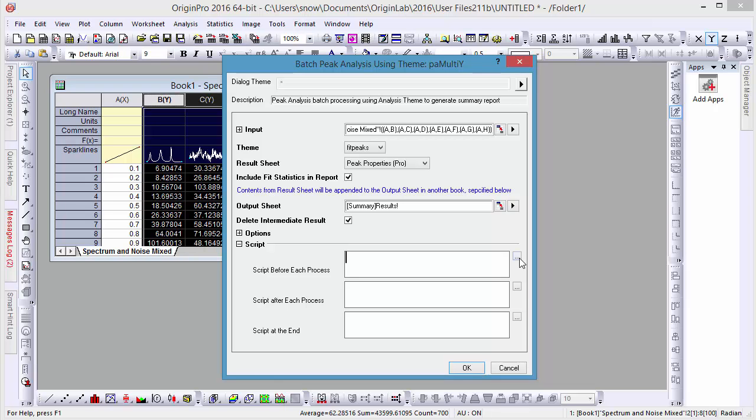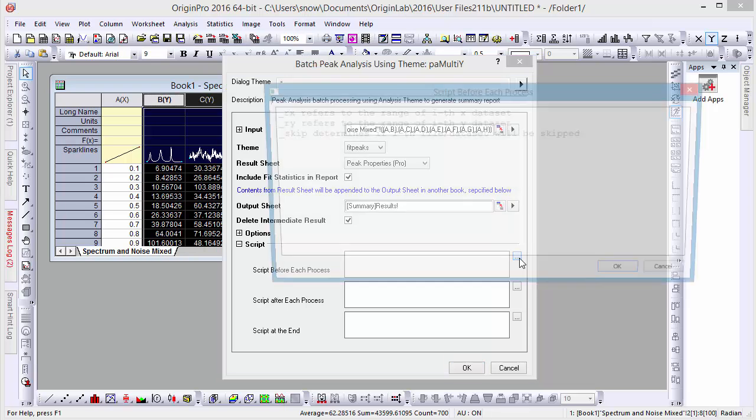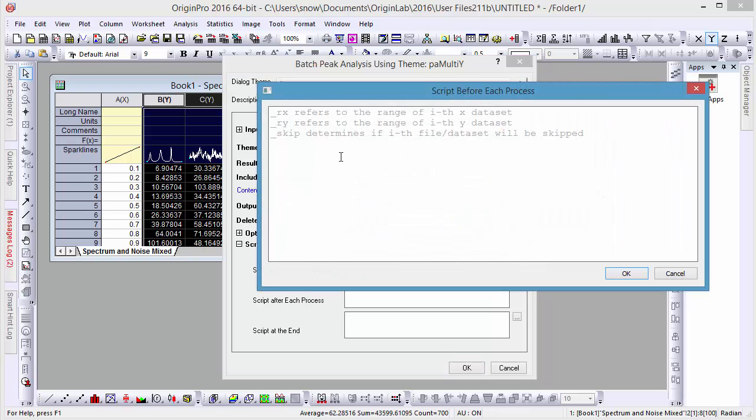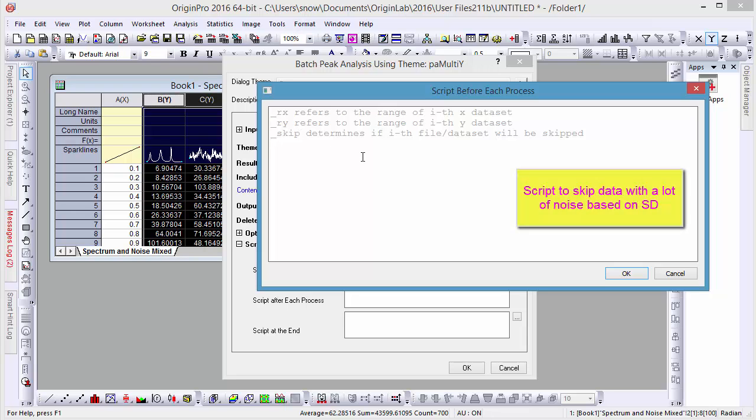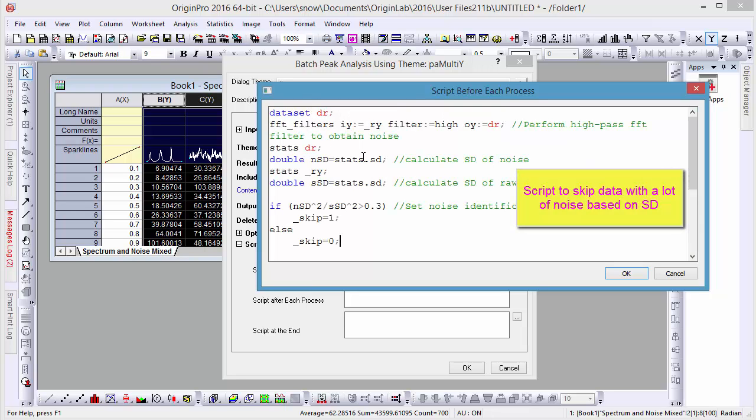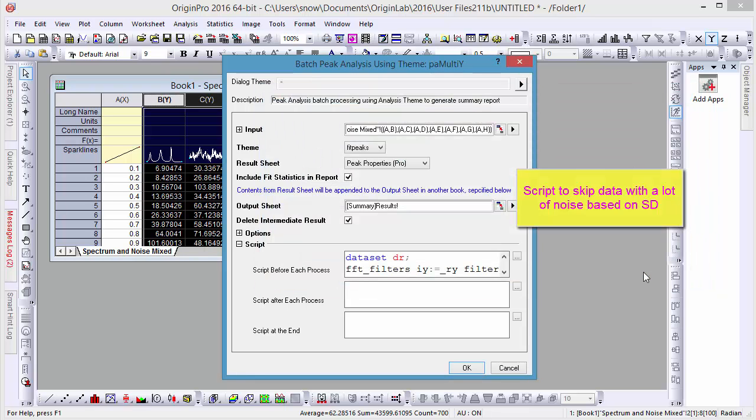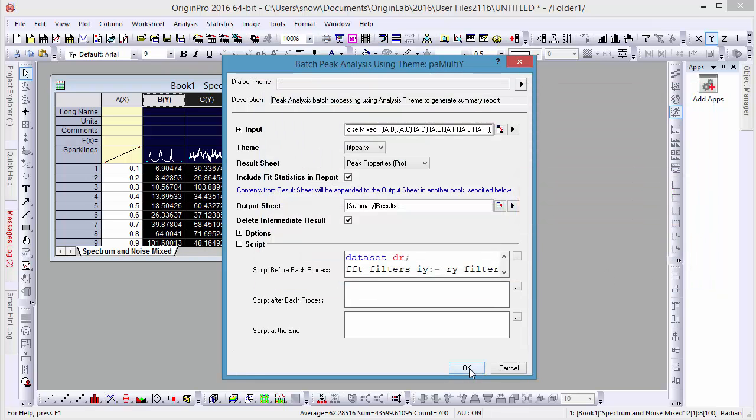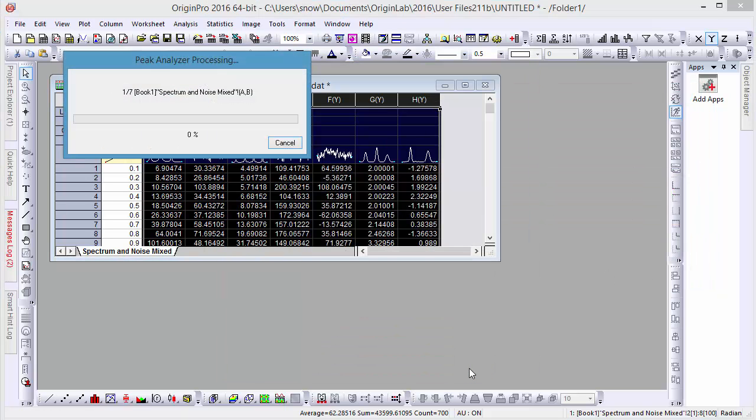To add our script, let's go to the Script Before Each Process box, and click on the Ellipses button to open it as a separate window. Here we can paste our script, which, in this case, is designed to skip data with a certain amount of noise based on its standard deviation.